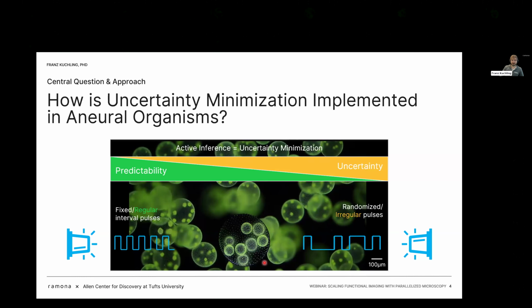So the way that I approach this on an experimental level, I put Volvox in these chambers and I would expose them to two different light pulse series, just two different LEDs at the end of the chamber.